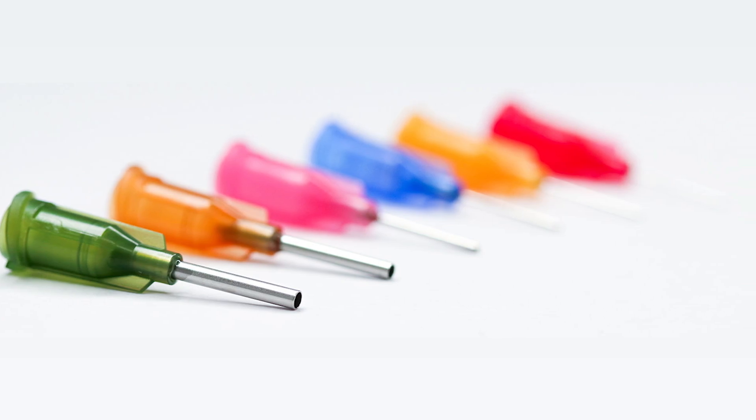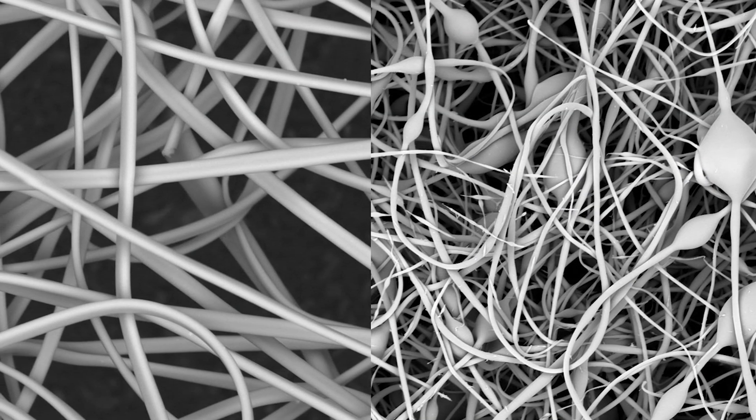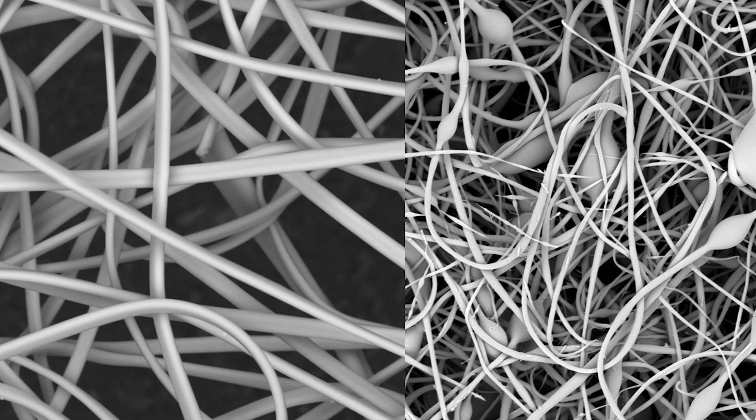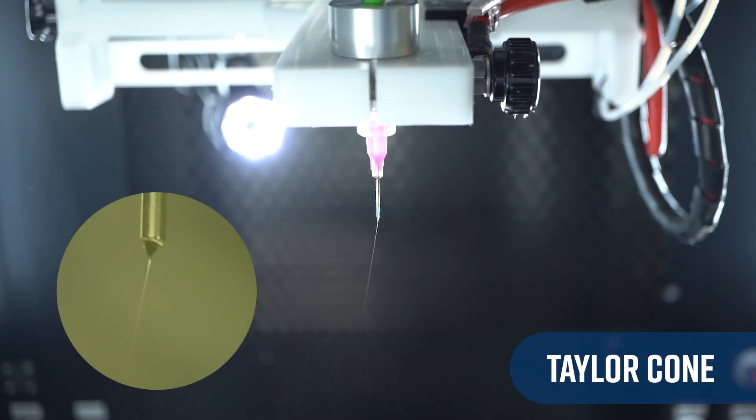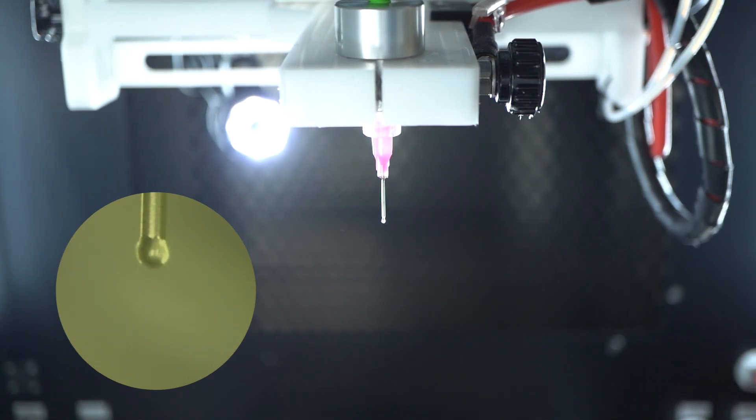For example, a stable and symmetrical cone typically means our process is near optimization and leads to more uniform fibers. However, if we have a receding Taylor cone, we may see drying at the needle tip, leading to non-uniform fiber formation or even no fiber formation due to clogging.